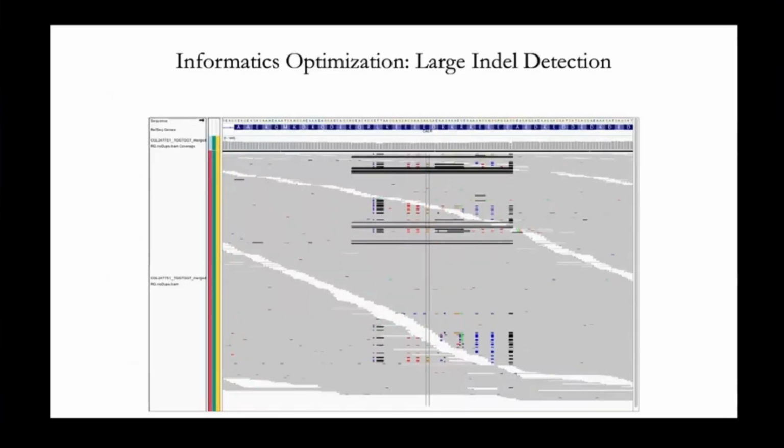For example, if you have a big insertion or deletion, BWA-MEM will mess it up because it penalizes itself so heavily for creating alignments with big gaps. Here is supposed to be a 52 base pair deletion in exon 9 of calreticulin. This is a really common mutation. It's one of the important mutations we see in myeloproliferative neoplasms, but the alignment here is awful.